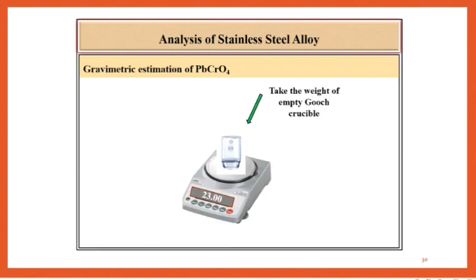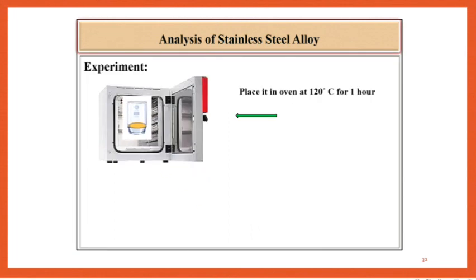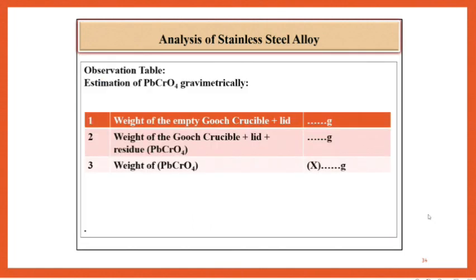Meanwhile, take the weight of the empty Gooch crucible. Filter the PbCrO4 precipitate through the previously weighed Gooch crucible and wash with 0.1% HNO3. Place in an oven at 120 degrees Celsius for 1 hour. Take the weight of Gooch crucible with precipitate and record as weight of empty Gooch crucible plus lid, weight with residue, and weight of residue.